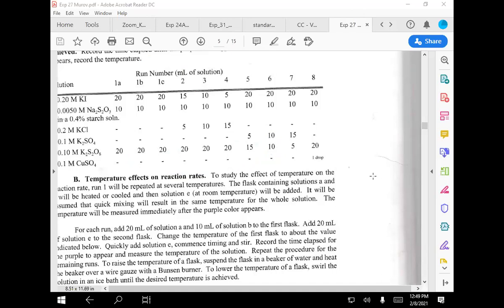With that, yeah, question? The one that we just did, where only half as much of the product came out. It's not that the product's coming out. Look at how we set up this experiment. If we compare this one to this one, the iodide changed, but the S2O8 didn't change. So you could compare that and see, does the rate change? If the rate does not change, it's zero order in iodide. If the rate does change, then iodide's in the rate law.